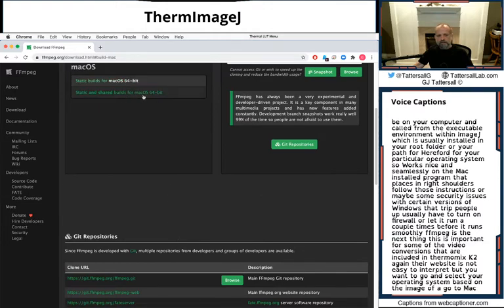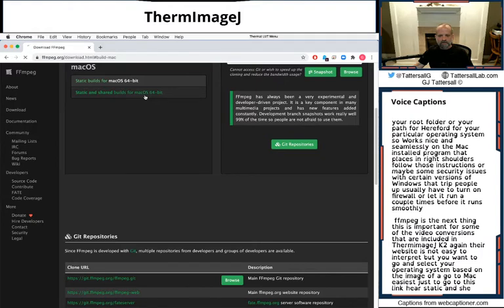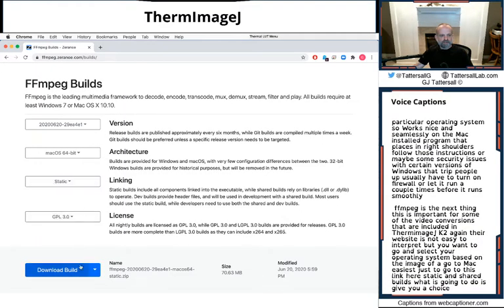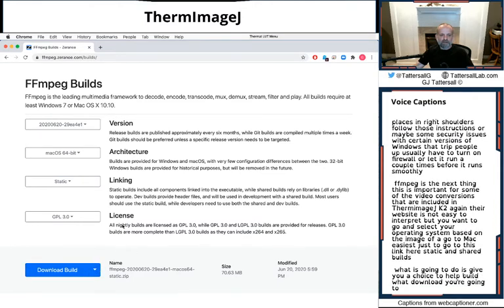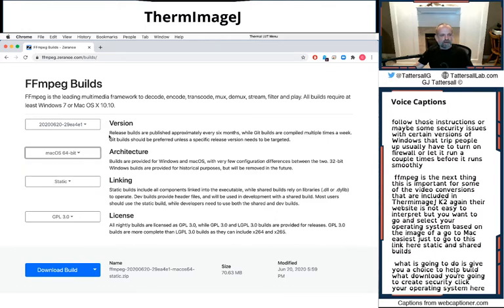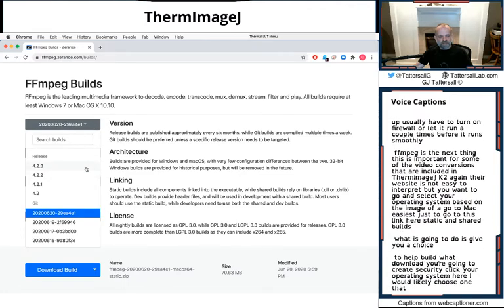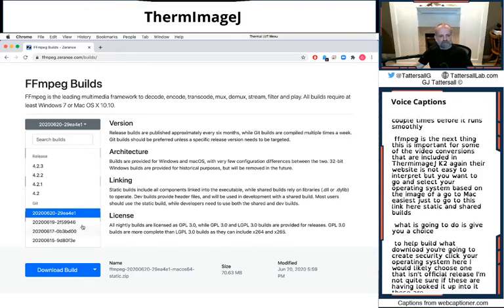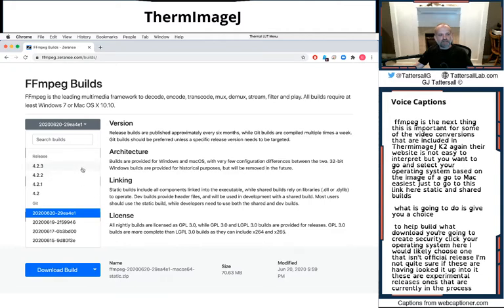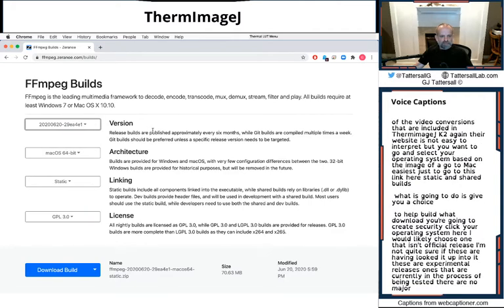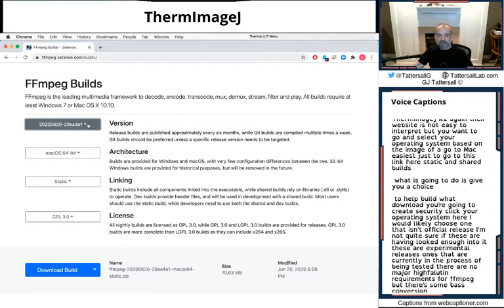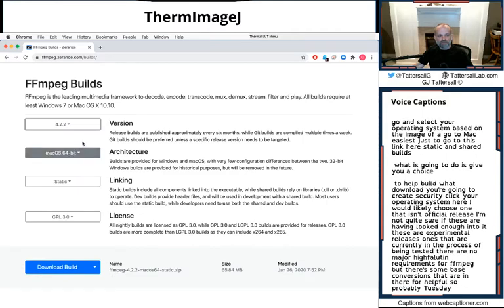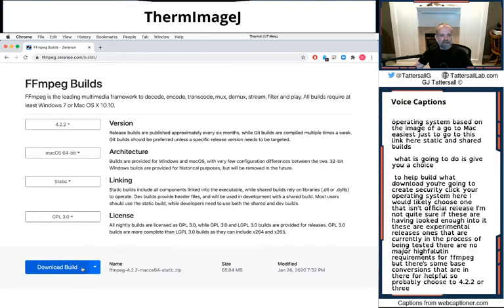What it's going to do is give you a choice to help build what download you're going to create. So clearly you click your operating system here. I would likely choose one that is an official release. These are experimental releases, ones that are currently in process being tested. There are no major high-falutin requirements for FFmpeg, but there's some base conversions that are in there that are helpful. So probably choose the 4.2 or 3 and then click the download button.